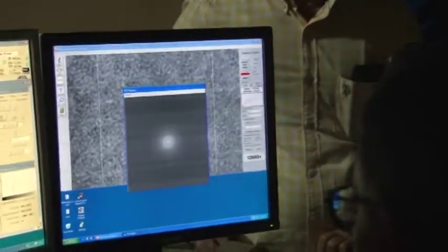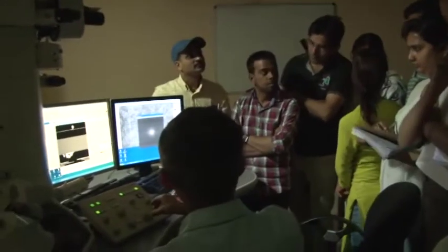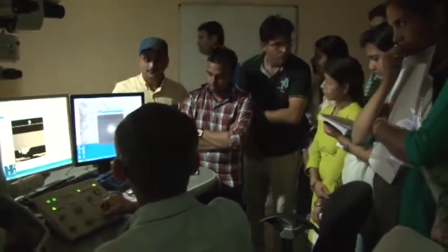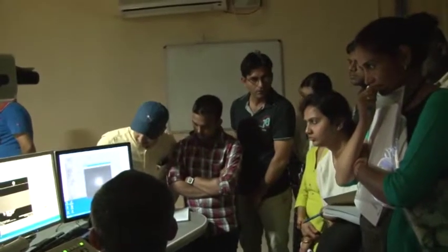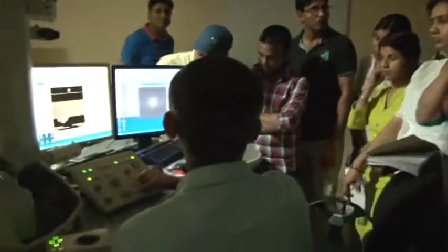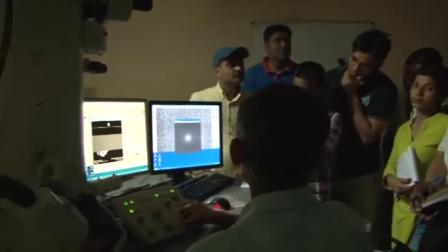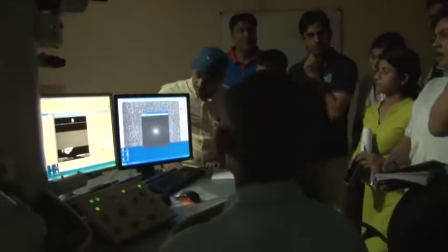Would you just detune it? Because now we see the amorphous material in the back, and if you detune it drastically, you will see the impact on the image of the amorphous support film. It's now gone, because we came closer to focus. Now you see rings are coming again. So this is defocus: the structures get broader in this high resolution image if you change defocus.